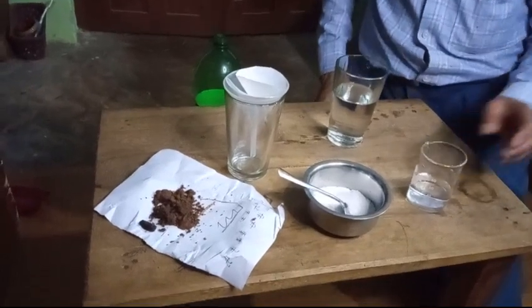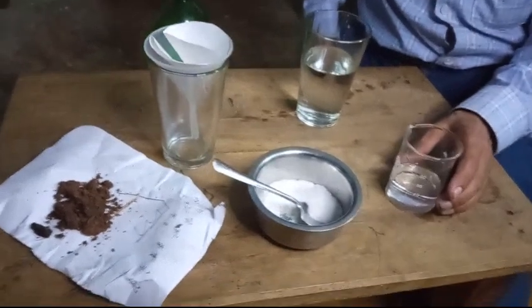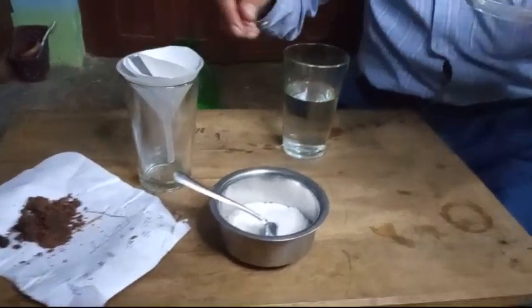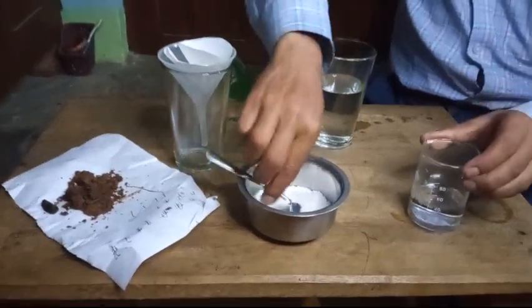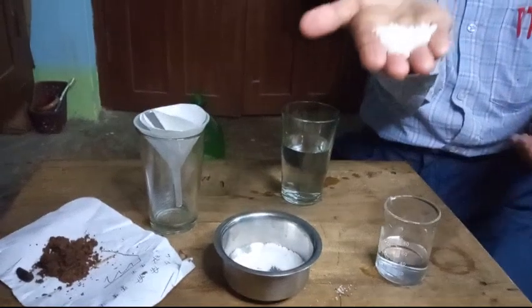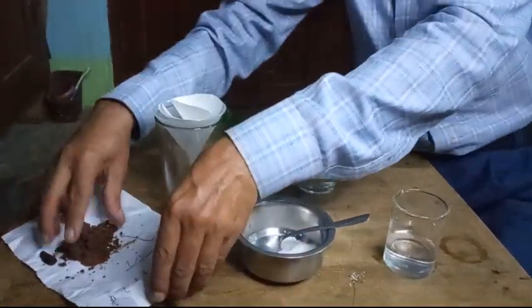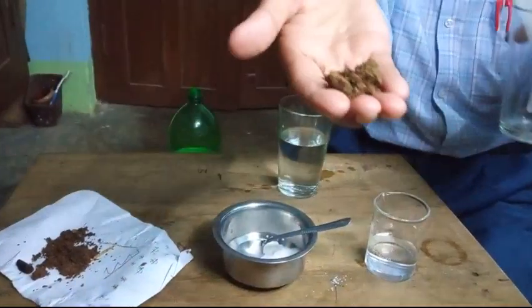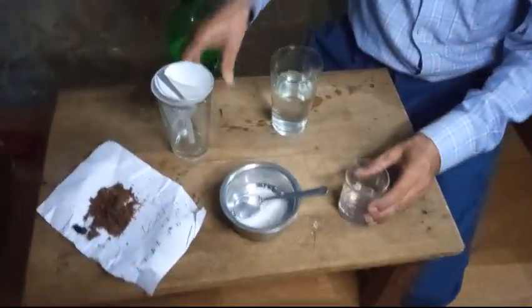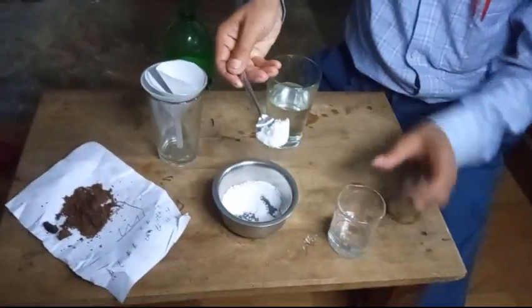Good evening, everybody. Today I am going to demonstrate two experiments. One experiment: a homogeneous mixture of water and sodium chloride. Another experiment is a heterogeneous mixture of soil and water. The first experiment is about a homogeneous mixture.